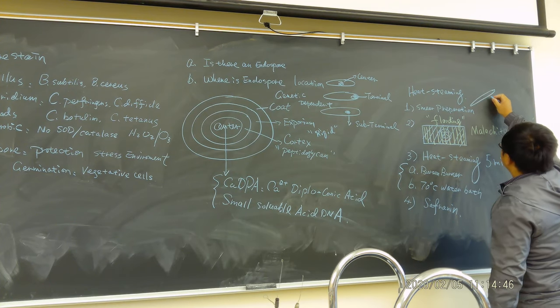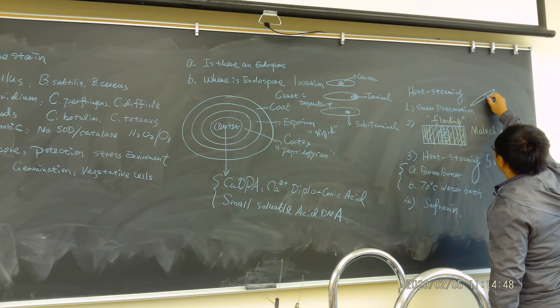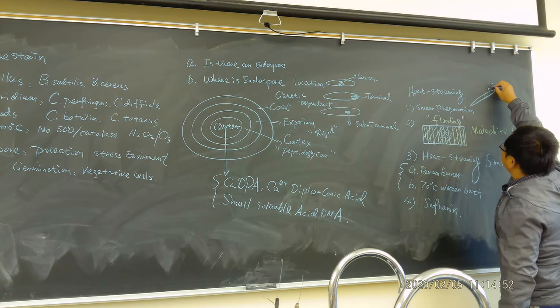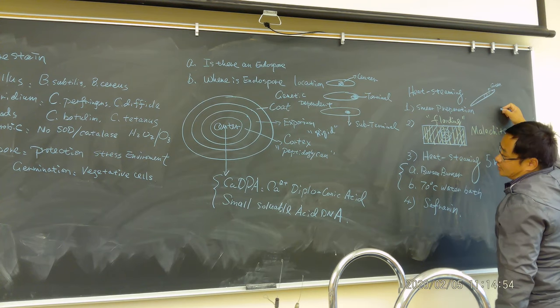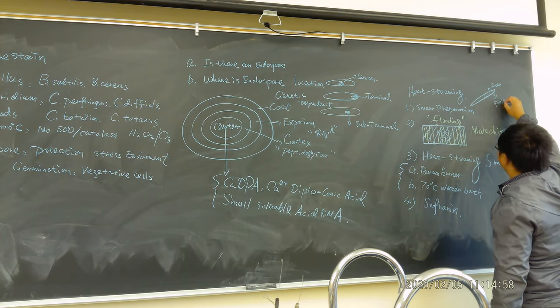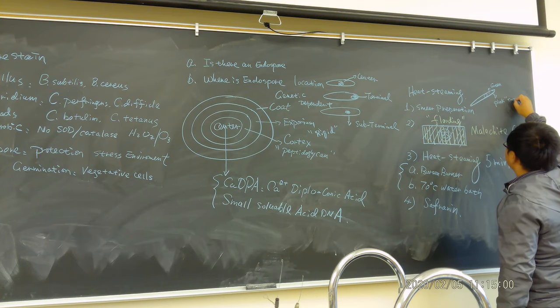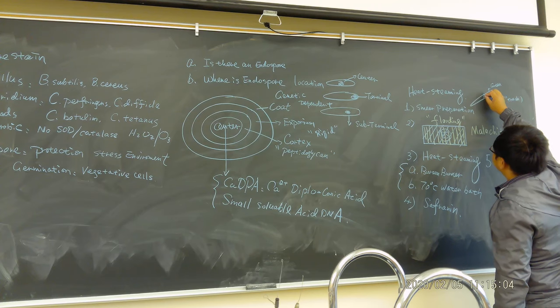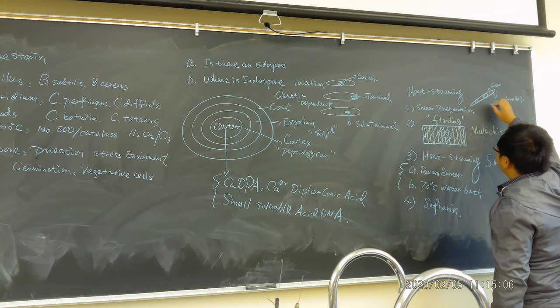So basically, what you're going to see for the endospore is lots of these areas of green. And there is a little bit of pink color, we call it trash. Not really something we care about. You will see this like a bubble. This is the endospore.